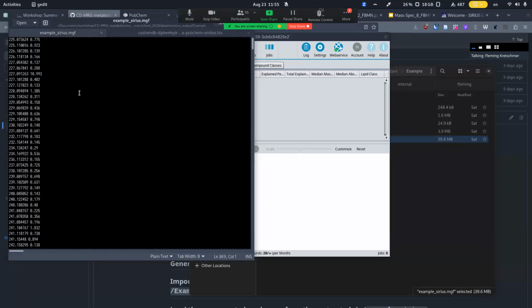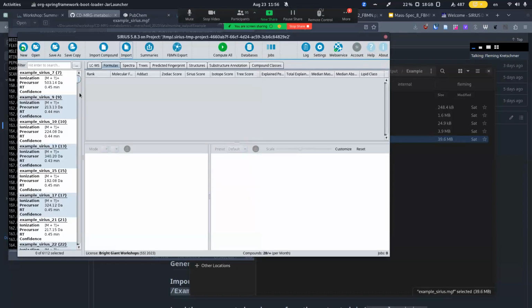Also Daniel touched on it a little bit, it's always a good thing to look into your data. Especially if you see that something is not working when importing, it's a good thing to just open up your data in some kind of text editor and see that the file is not empty and that everything you want there to be is also present.